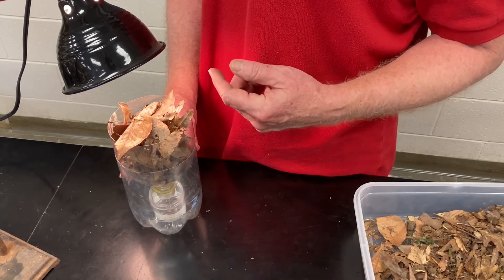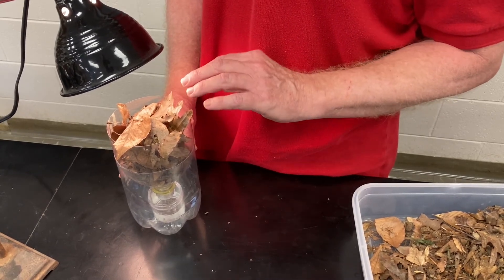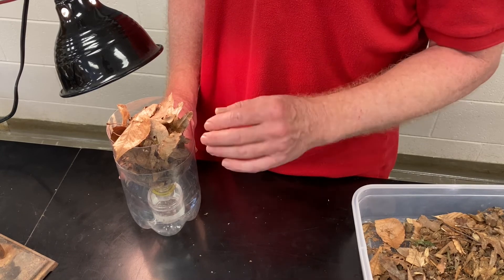Organisms that live in the soil normally avoid light, so this works two ways — it dries out the sample and also the light repels them.